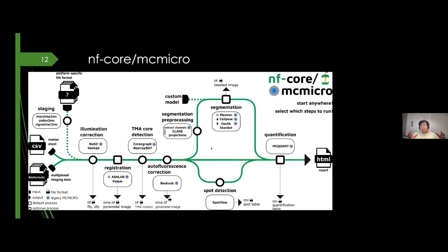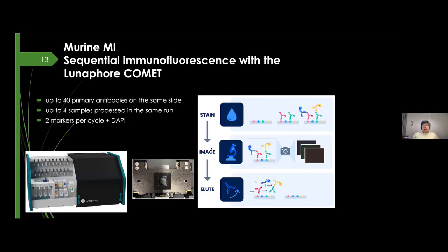In this case, all the modules that we had already prepared in a pipeline for NextFlow only, we migrated them to this NF Core community, and we're trying to follow every standard for it to make it available for a larger public. I'm going to show you now some of the instances where we use this pipeline.